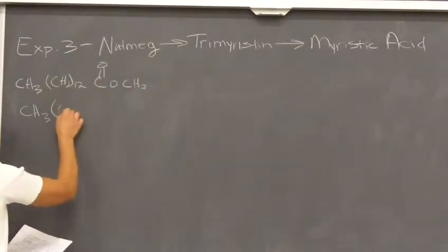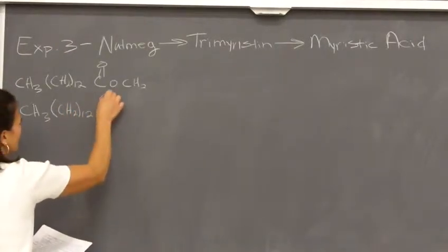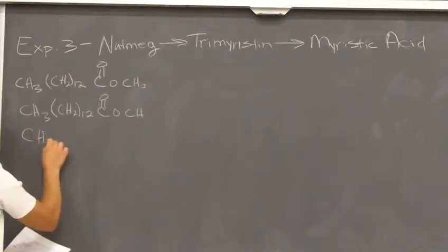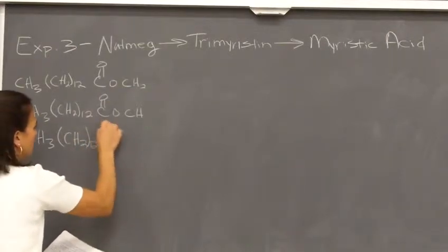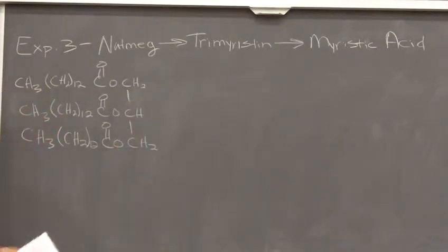And it's a triester, so there's 3 of these linked together. Okay, so here's our trimyristin.